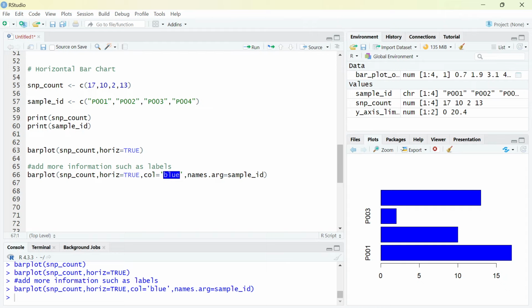What we can do in this situation is to change the font size so that we can have everything. Here we are going to change the font size of the labels, and that will help us to get everything into shape. So let's properly format the labels.